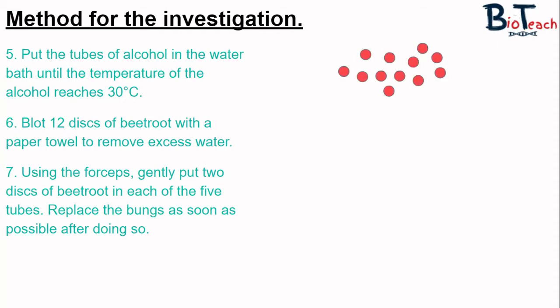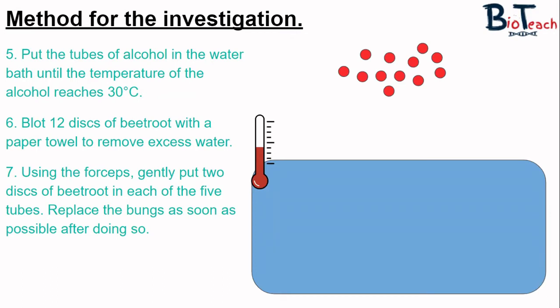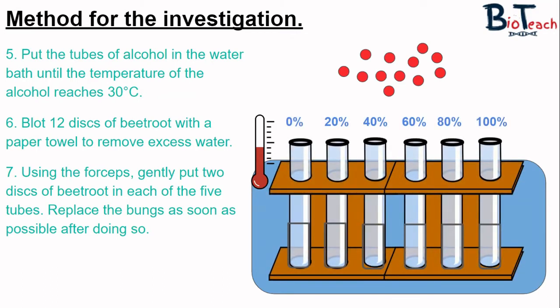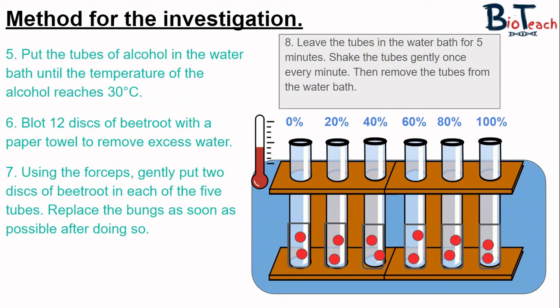When the temperature has reached 30 degrees, you need to blot 12 discs of beetroot. If you have a helpful technician or teacher they may have already prepped these discs, but if you need to make them yourself they can be made using a cork borer size four and then sliced down to size. We blot the outside of these to remove any excess water and also to blot away any pigment that might be on the outside of the disc. Using forceps, transfer two discs into each of the boiling tubes and replace the bung. These will be left in the water bath for five minutes, and every time a minute passes you are required to shake the tubes gently to mix up the solution.